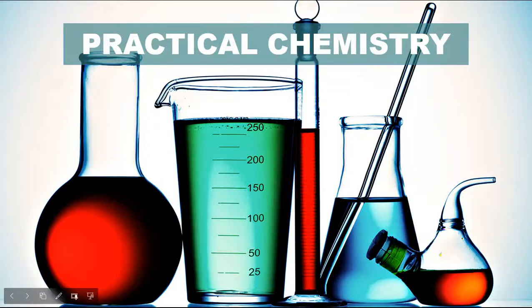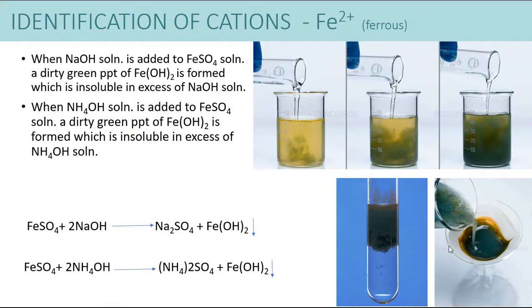Hello students, we'll study about practical chemistry. So under practical chemistry, we'll study about identification of cations.